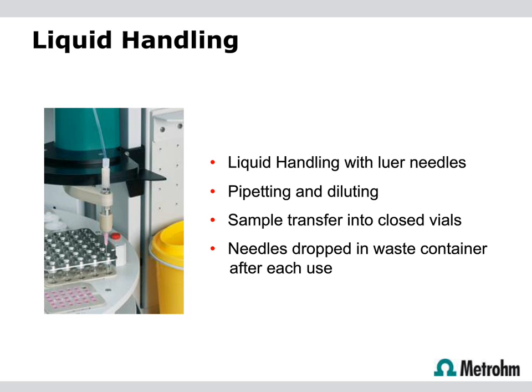So to summarize, I know it was only a quick presentation, but we've gone through ways of inline sample preparation for simplifying the preparation from your auto sampler to your analytical instrument. And then we've gone one step further with a fully robotic sample processor, which can take solids, liquids, and deliver them directly to an analytical instrument. The overall goal here, of course, is that automation can improve precision and minimize the lab use time of staff in the lab.